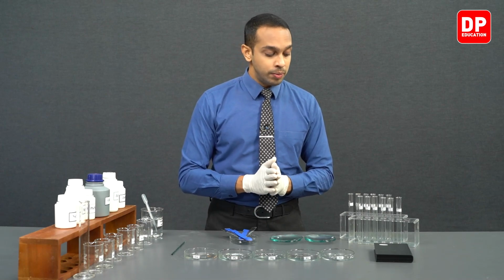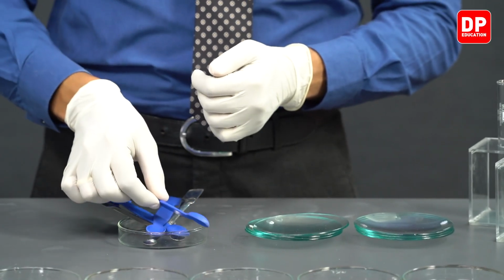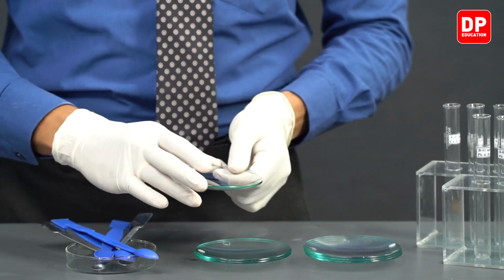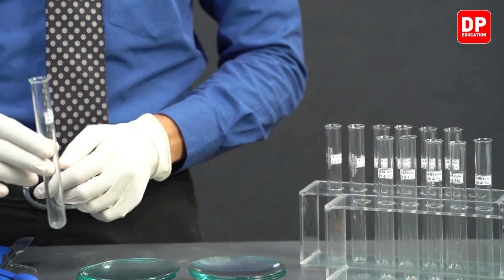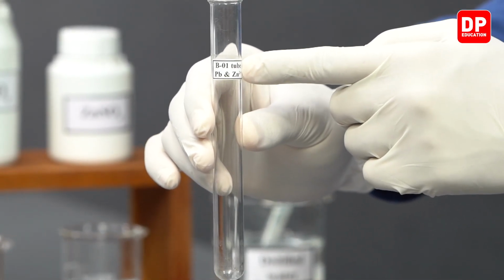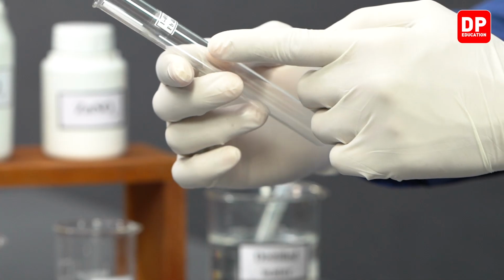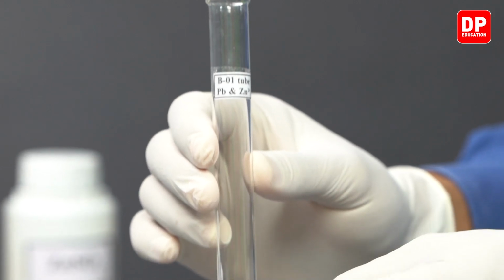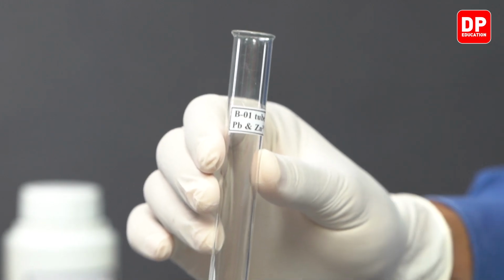Apart from these metals, we'll be using other equipment like a spatula, watch glasses, and test tubes. Now keep in mind, students, each of these test tubes will be labeled. The label would read what 2 components are mixed in the test tube. Over here it reads lead and zinc 2 plus ions. So we are going to observe in this test tube what happens when lead metal is added to a solution containing zinc 2 plus ions.